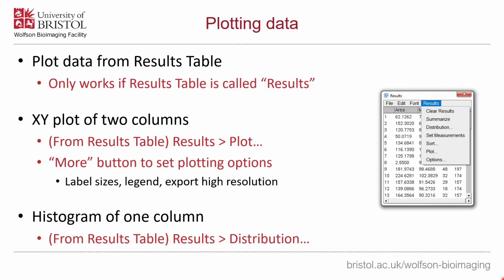With the measurements for our nuclei, we're just going to have a quick look at some of the plotting and fitting tools that are available in ImageJ. From the results window, you have this Results menu that we briefly touched on earlier. One of these options is Plot.